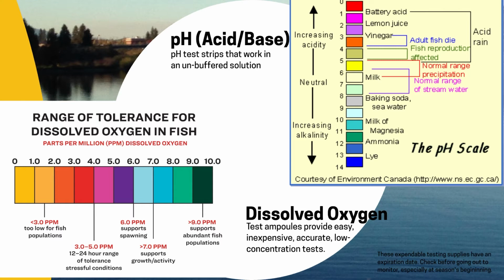Our assessment form also includes a line for entry of chloride data. IDAH2O discontinued collecting chloride data because the test strips are somewhat expensive, and Idaho's waters rarely have any measurable chloride concentrations using this technique. You are welcome to measure the chloride. I can get you information about the type of test strip to use, but you'll need to source the test strips yourself. This is not a mandatory field in which to enter the data on the online form.